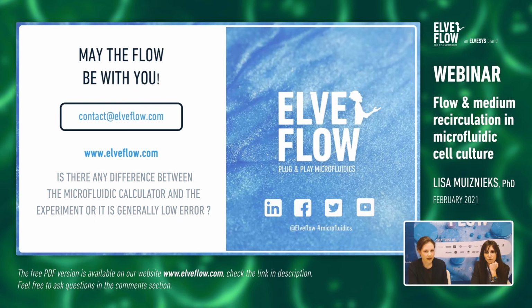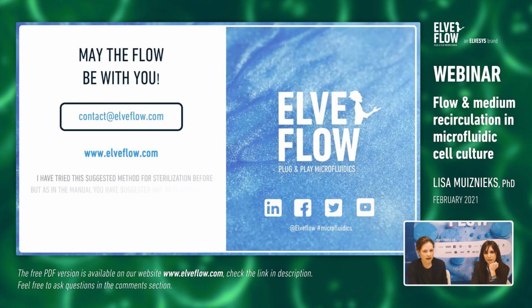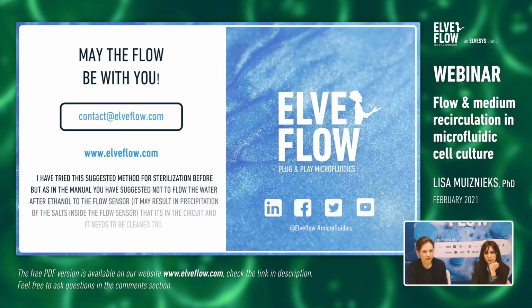Shoresh asks: I've tried this suggested sterilization method before, but in the manual you suggested not to flow the water after ethanol to the flow sensor. It may result in precipitation of the salts inside the flow sensor that is in the circuit, and it needs to be cleaned too. Yes, this is only at the very end of your experiment, if you are putting your flow sensor away.